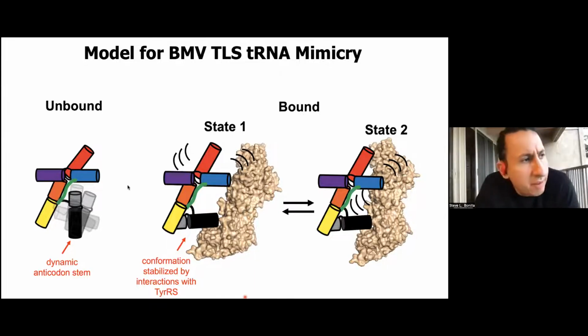Yeah, so we found that the concentrations tend to be higher than what you would use for proteins. I will usually start with like 10 micromolar. You have to do the conversion there, and these are small RNAs, around 55 kilodaltons. 10 to 50 micromolar is what we used, which I believe is a higher concentration relative to proteins of similar size. Yeah.